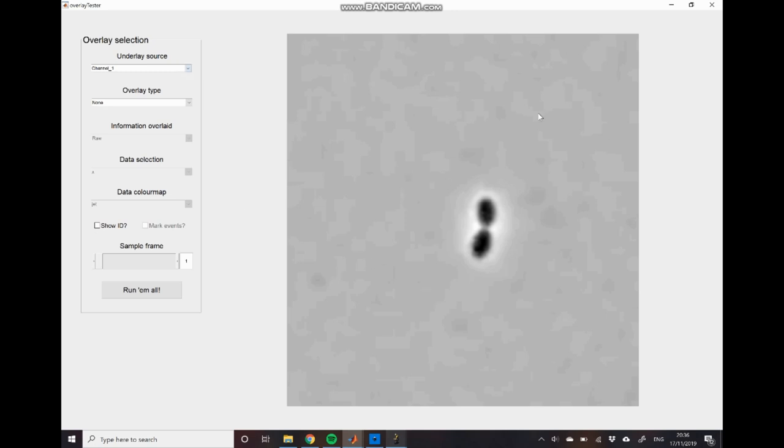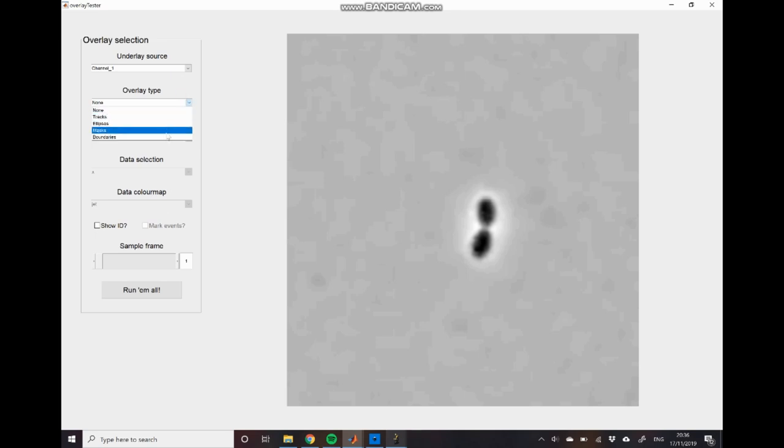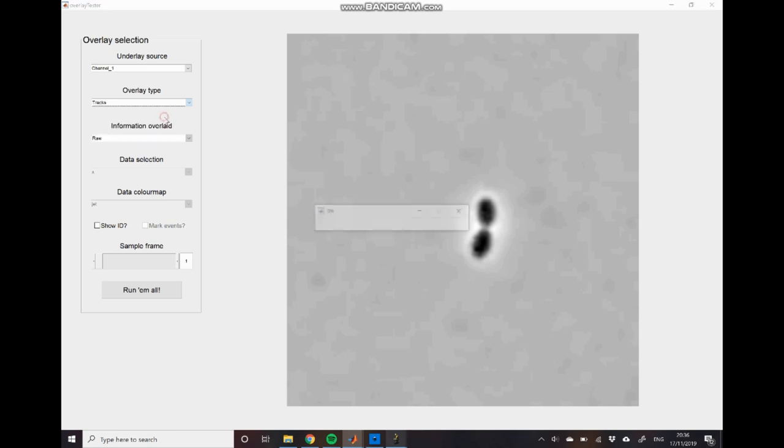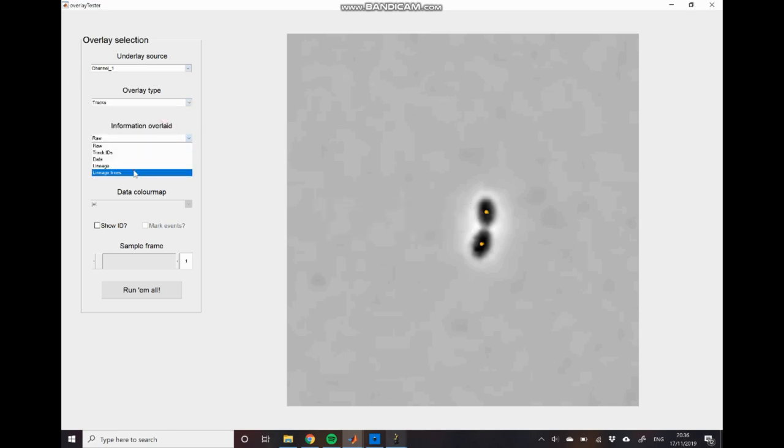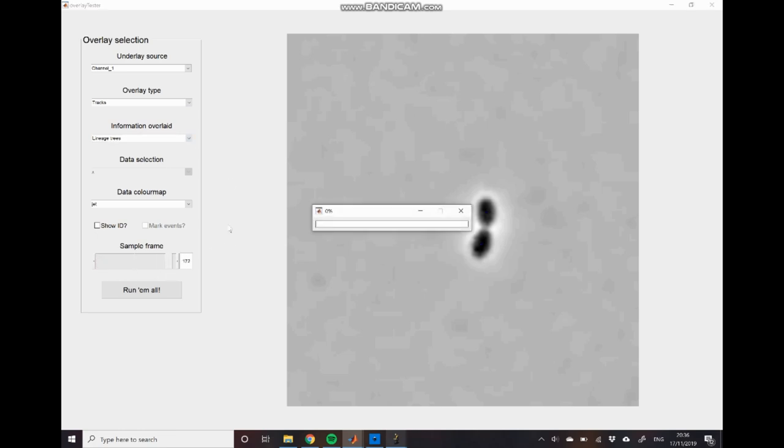So in this case we have the bright field data or phase contrast as it might be. And we're just going to select tracks as the overlay type. And we'll also select lineage trees in the information overlaid. And if we now move to a late time point, say in this case 172, close to the end of the entire dataset.